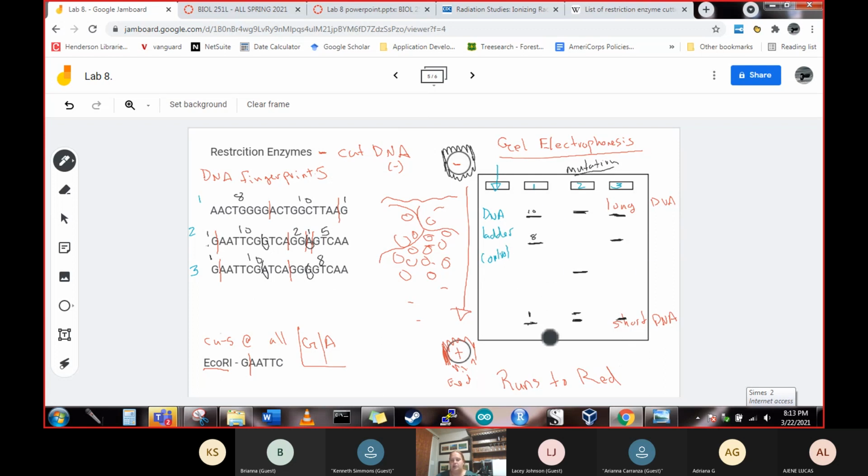And then when you get a mutation, you get these different patterns showing up, or those changes in the DNA that you can track and say, this was our starting point, we had a mutation, and then all of a sudden this is the pattern that you're seeing. So this is one way that you can track diseases as they move through populations as well. Very fascinating stuff.